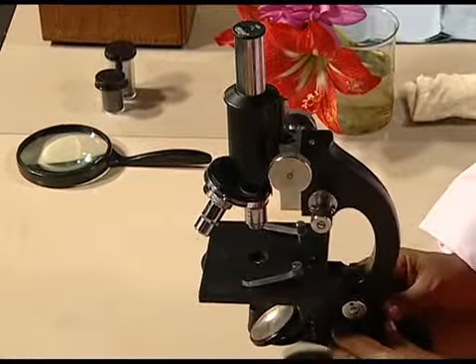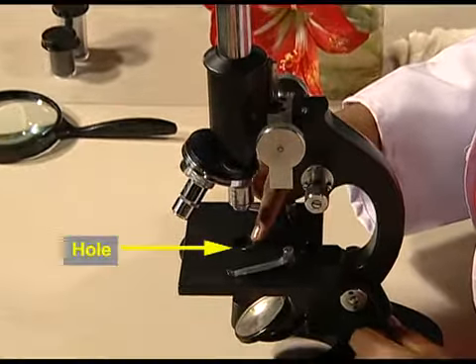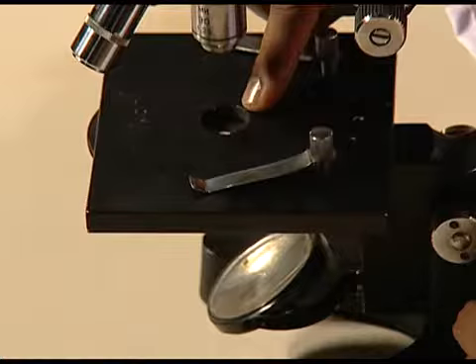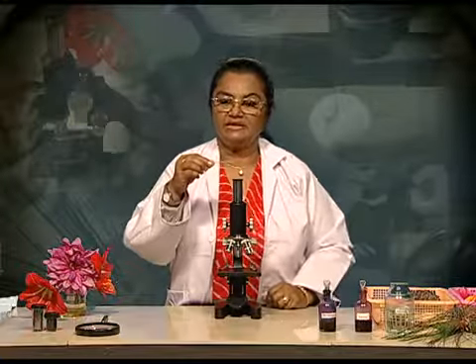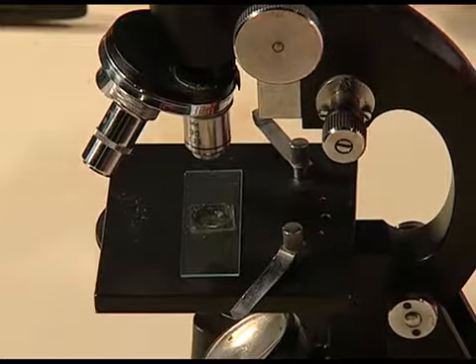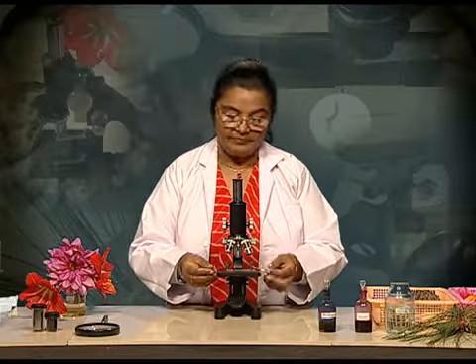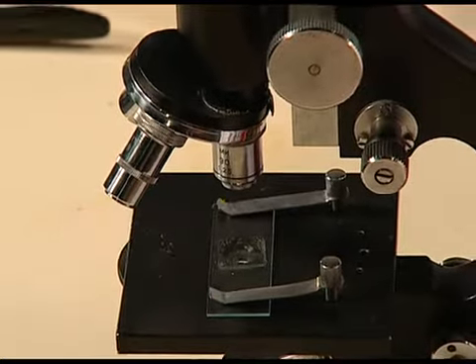As we saw in the dissection microscope, this stage has got a small hole in it. This is where precisely our object should be placed when we place a slide on the stage. So I take the same slide of the pollen grains, and this is where I will position the object right over the hole on the stage. On the stage, there are these two clips to hold the slide into place.